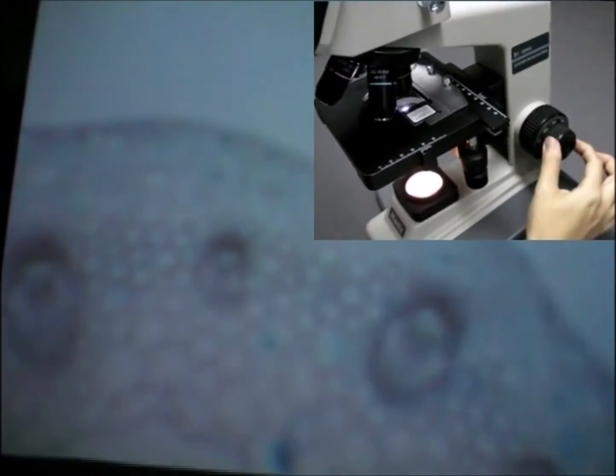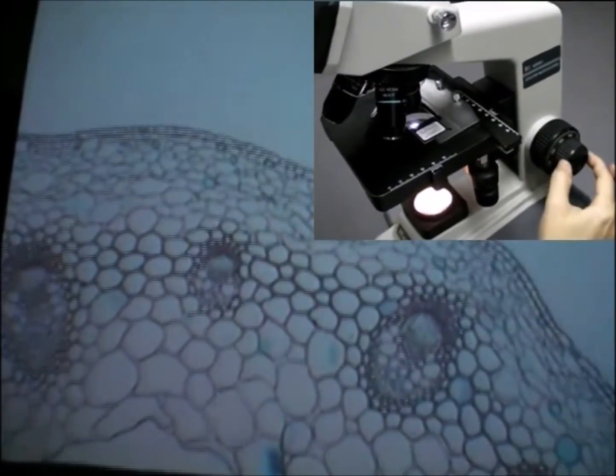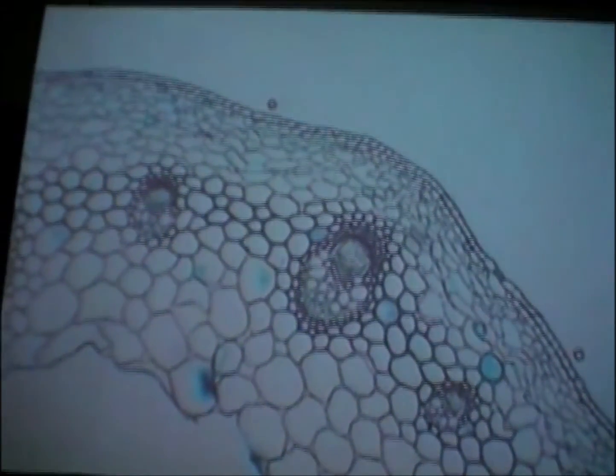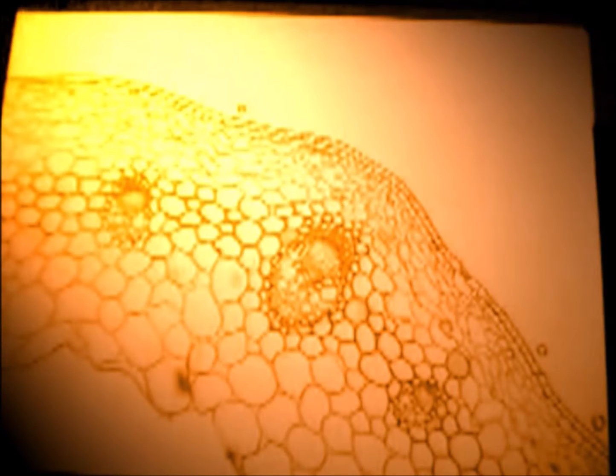Then, change to the objective lens of the next higher magnification, for example 10 times. Now, the object will be blurred again. So, you will need to refocus the object by using the fine focusing knob. Now, the cells look bigger. You can notice that there are fewer cells visible here than at the previous magnification. Only those cells at the center of the field of view in the previous magnification can be seen in this magnification.